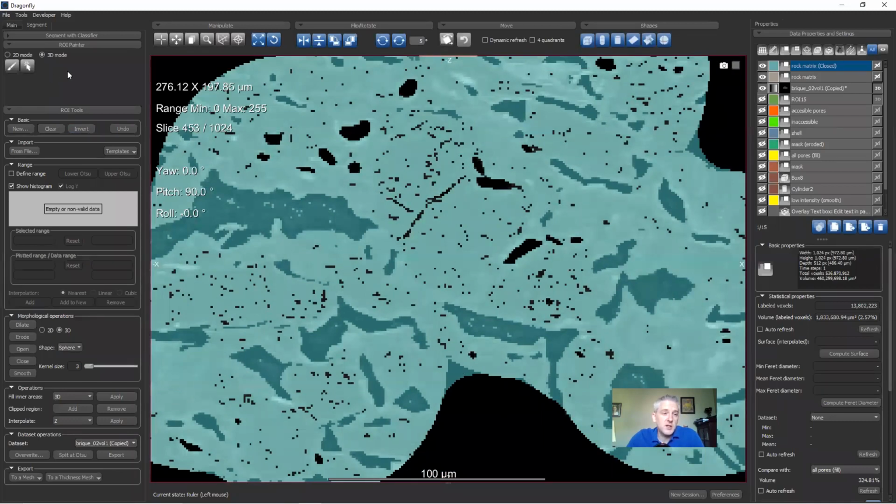If you learned in the ROI Painter lesson in lesson 7, this point and click tool you could use to erase this cluster, for example. So you could manually prune it, and it might only take you 5 minutes to remove all those from the surface. That's a good idea. I should show that.